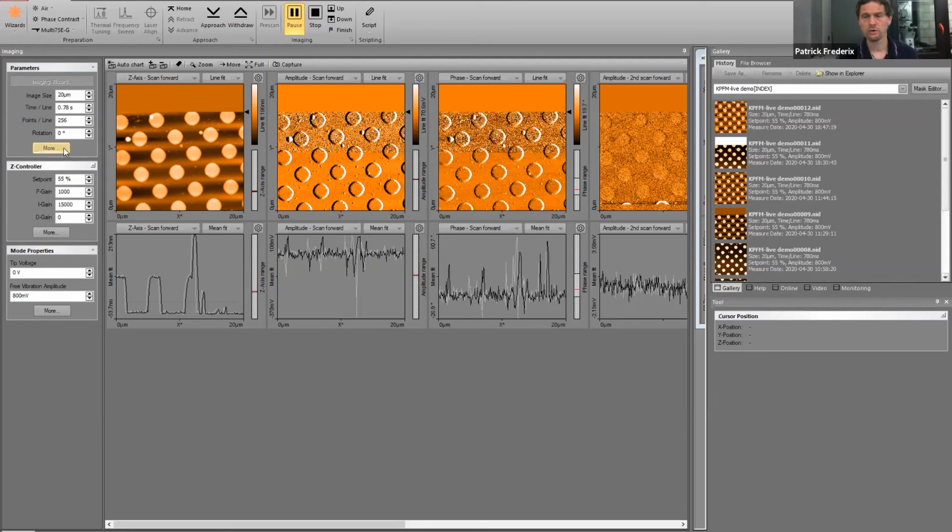The attractive force that you create by the voltage also changes the resonance frequency of the cantilever, and you can observe that by a change in phase. What you do in EFM is measure this phase change when you scan over the surface.